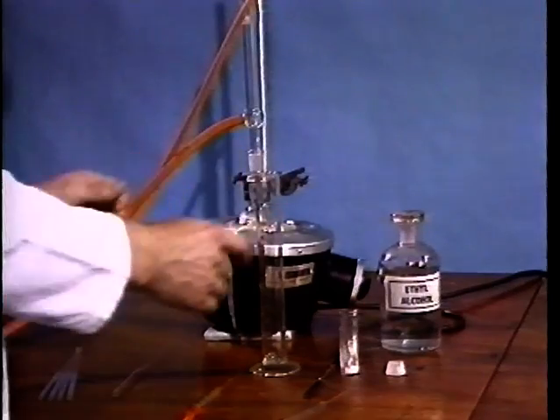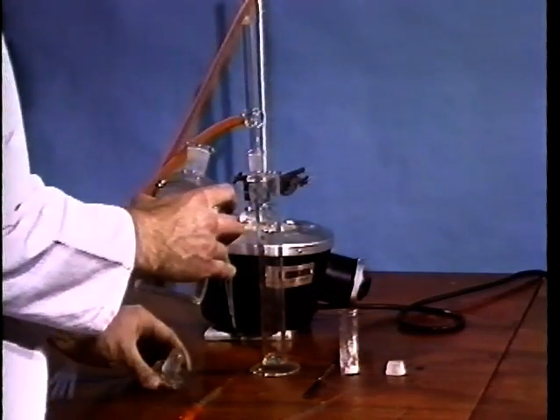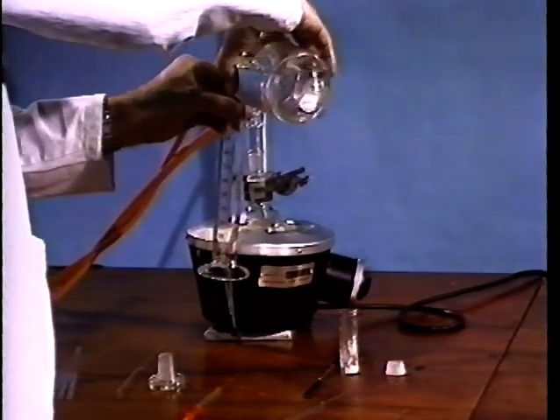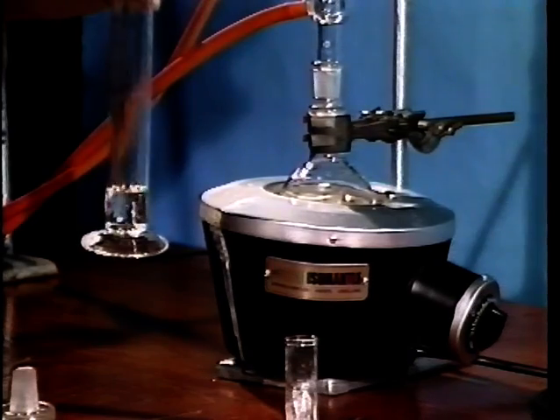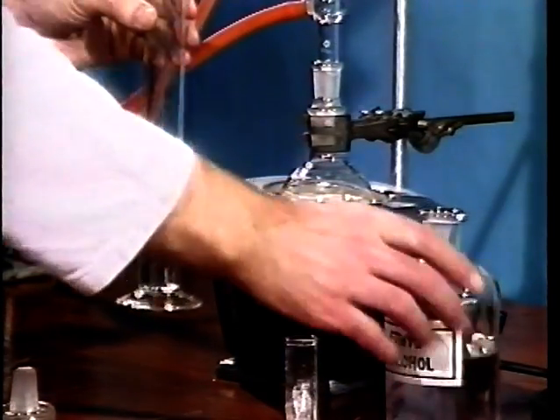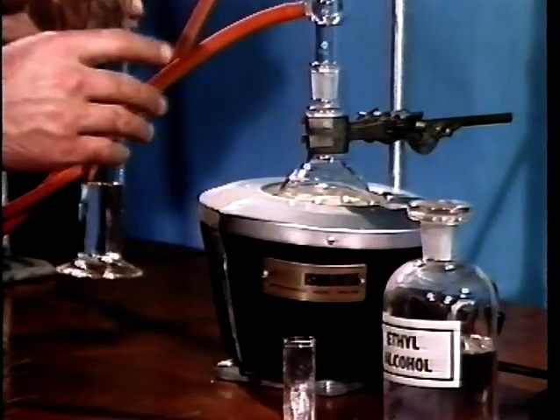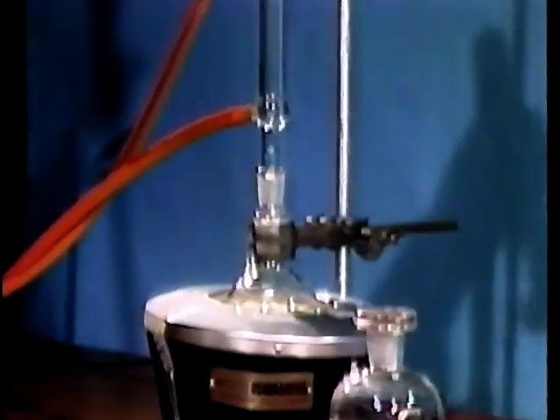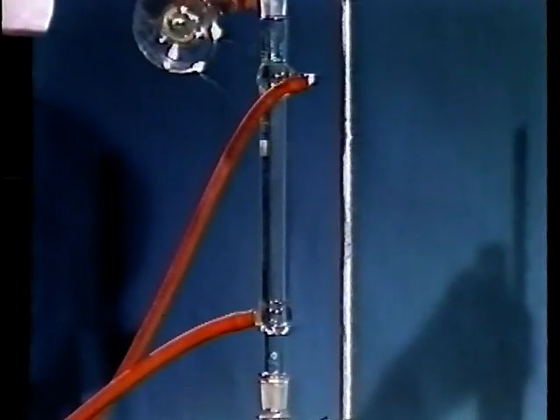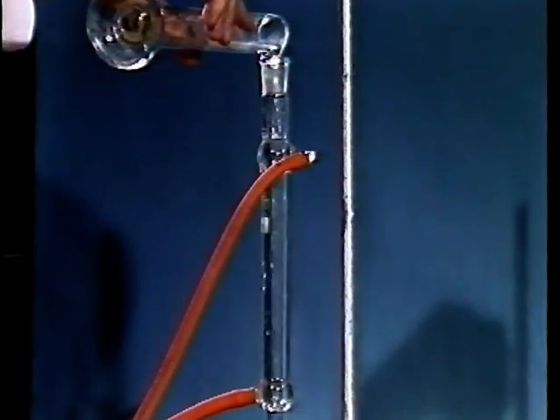Measure out a volume of the solvent which you found was useful for recrystallization, so that you may determine afterwards how much of that solvent you used. Pour sufficient solvent through the condenser in order to wet the solid well.